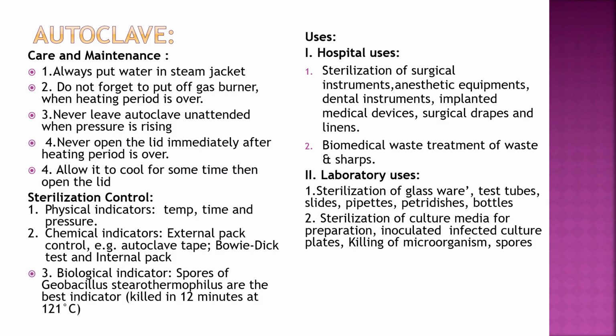The care and maintenance of the autoclave. We have to always put water in the steam jacket. Do not forget to put off the gas burner after the holding period is over. Never leave the autoclave unattended when pressure is rising, and never open the lid immediately after the heating period is over. So we have to allow it to cool and then open the lid.